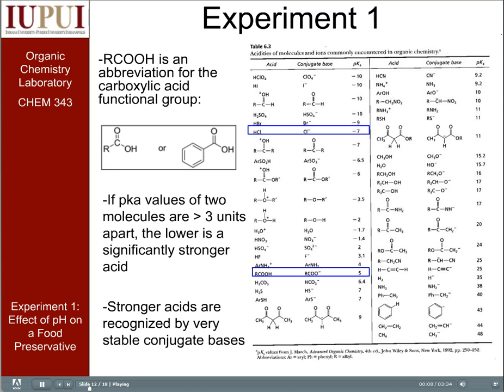This is extremely essential to understanding some of the major concepts of the organic lecture too. Some things we do in lab aren't crucial to the lecture. This is 100% crucial. So make sure you get this point. Don't just skip over it. Looking at our two materials, we had a carboxylic acid. That was the product in the reaction on the last slide. A carboxylic acid uses the notation R and then a carbon double bonded to an oxygen with an OH attached.